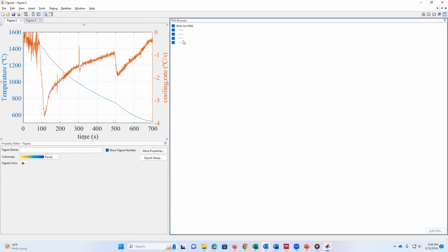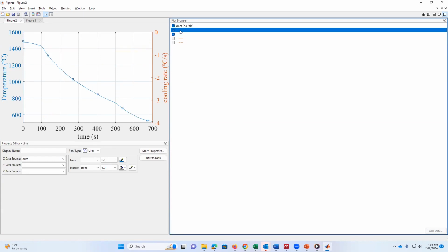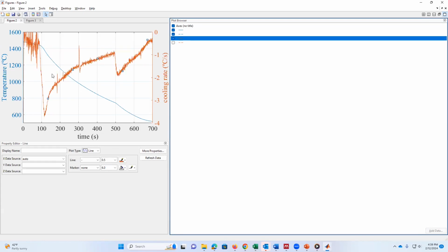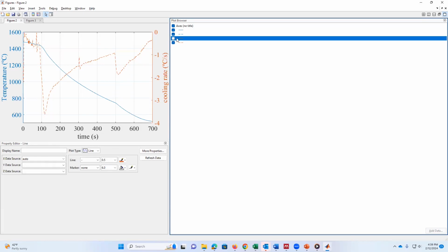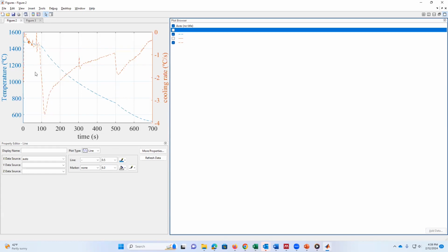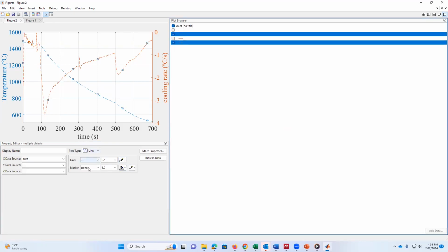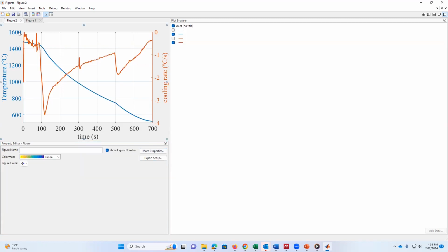we have more plots here. Notice the first plot here is the temperature versus time, so it doesn't look too different. But when I open the first derivative in the first one and the second, you notice that the first derivative after the filter is much smoother, because we are applying this filter. So I can basically use this one. And by the way, I can change the type of lines here. By selecting these two, I can select the type of lines, and I can also make them bigger, so for example, like that. Okay. So I can see here clearly all of the transition points.